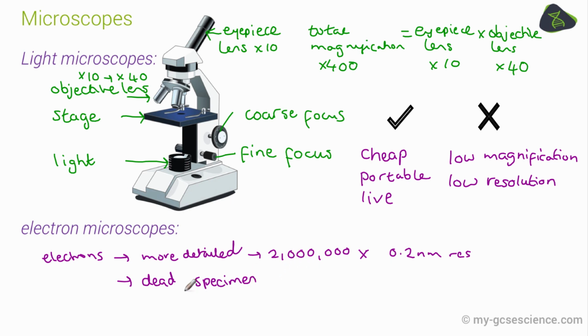They are fantastic, but what you're seeing is dead, and unless you're a millionaire, you can't afford them. They are very expensive. They're huge, so they're kind of floor to ceiling machines, so definitely not portable.